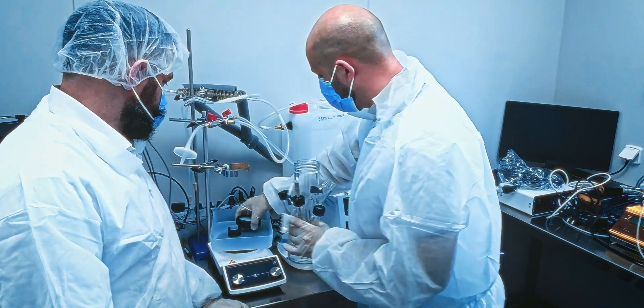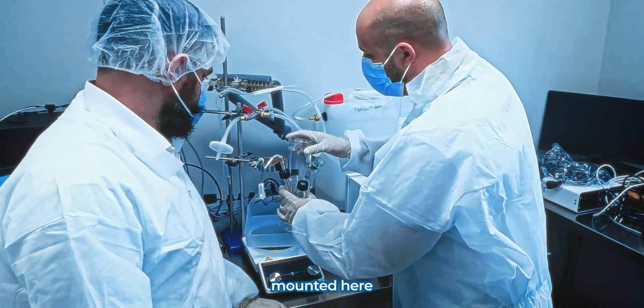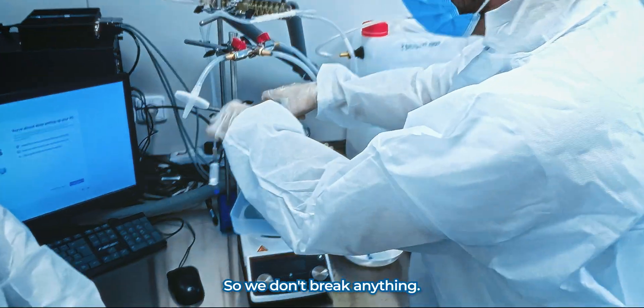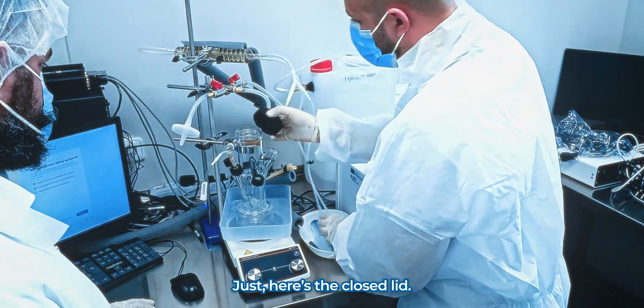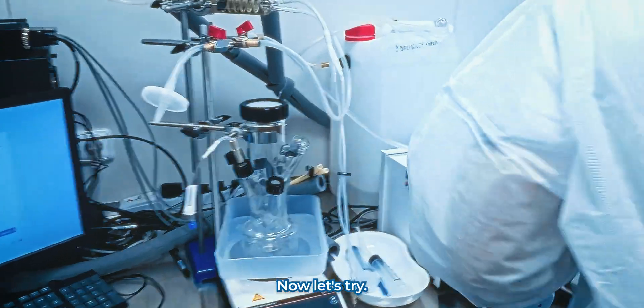Then the reactor is basically mounted in here. So it's stabilized by this huge flange. So we don't break anything. So let me quickly demonstrate just is the closed lid. So it's a service lid.